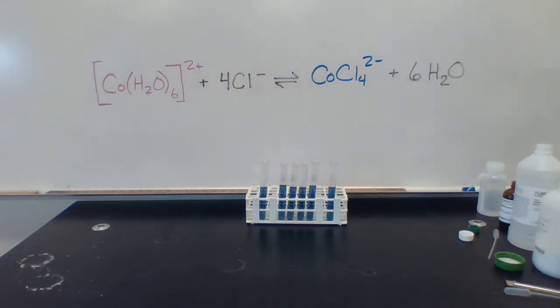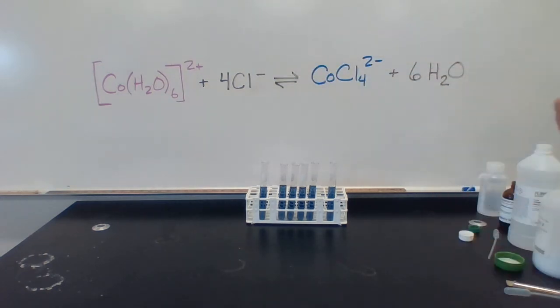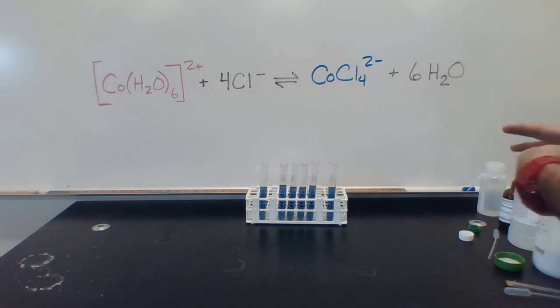Purple is an intermediate between our pink and our blue, showing that at this equilibrium we have a significant amount of each. We will see color changes as it shifts back and forth when we add or remove a reactant or product to apply a stress. Remember, as we do that, the reaction is shifting to keep the same overall ratio of products to reactants. But if I add any of these things or remove one of them, then that one is out of whack and the other three have to change in order to respond.